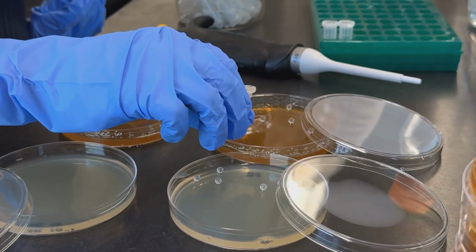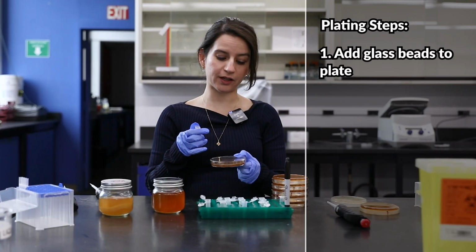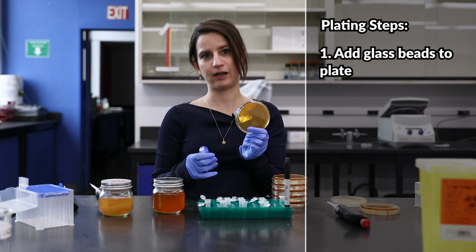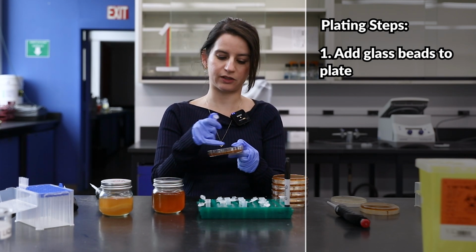The next step is to add a few glass beads to our Petri dish and shake it. The purpose of using the glass beads is to ensure that whatever cells are plated on here are evenly distributed across the surface of the plate. This makes it possible for single cells to pop up and for us to count single colonies.